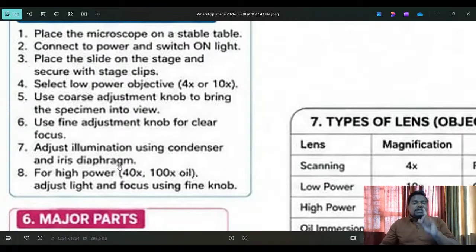So what are the parts? That's why I have explained very well about the picture of the laboratory equipment, the binocular microscope, which is what I am using here. You have to know it and you have to operate it. My advice is, as a biomedical engineer, you have to try to use the technical terms. Biomedical terminology is very important. Because you are a qualified person, you should behave like a professional, right?